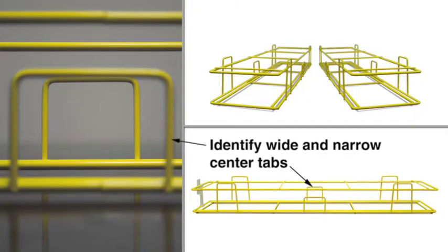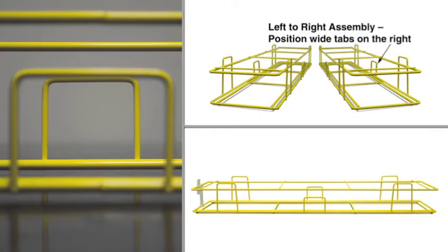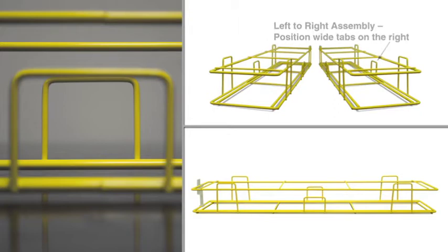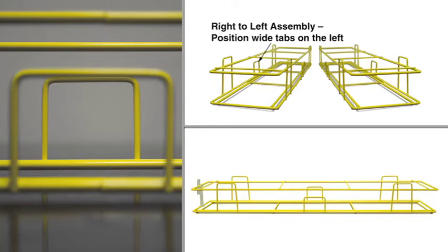Rack frames can be assembled from left to right or from right to left. Locate the center tab on either side of the rack frame. The tab on one side is wider than the tab on the other. Our demonstration will be done from left to right, so the wide tabs should be on the right-hand side. For right-to-left assembly, wider tabs should be on the left-hand side.